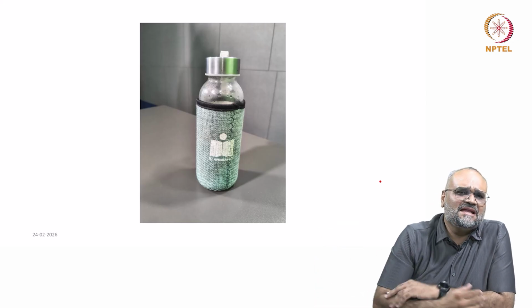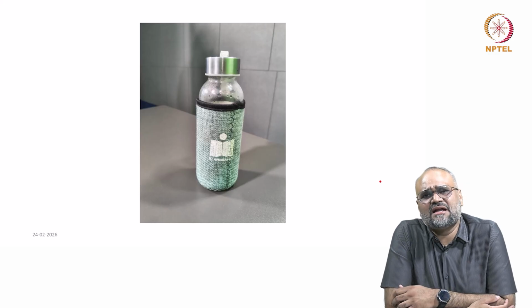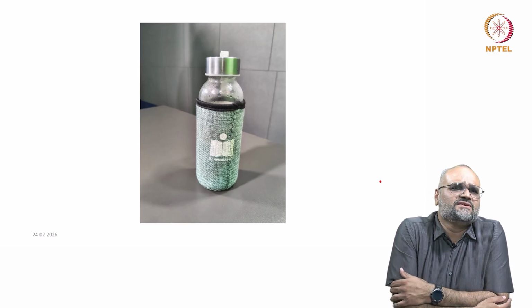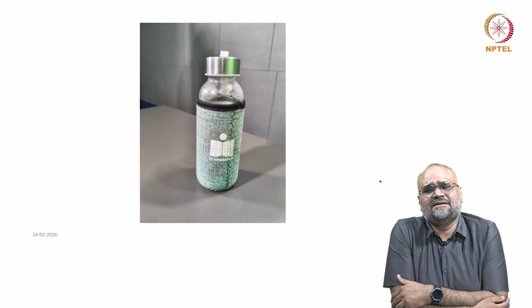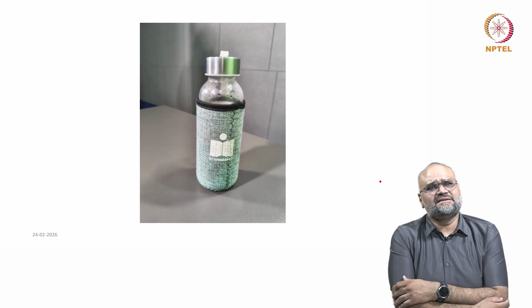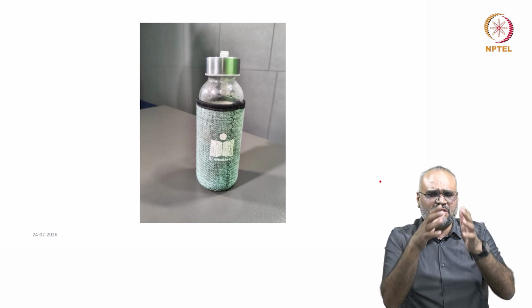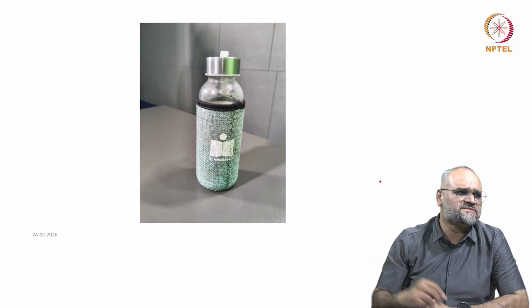Likewise, in any imaging tool, you can start introducing some kind of a modulation, and typically, because in all microscopes we use circular apertures, a point object starts appearing like the Airy disk that we have talked about when we introduced the concept of resolution. So likewise, within a microscope, a point object starts getting blurred and appears more and more blurry, and this is called the point spread function.